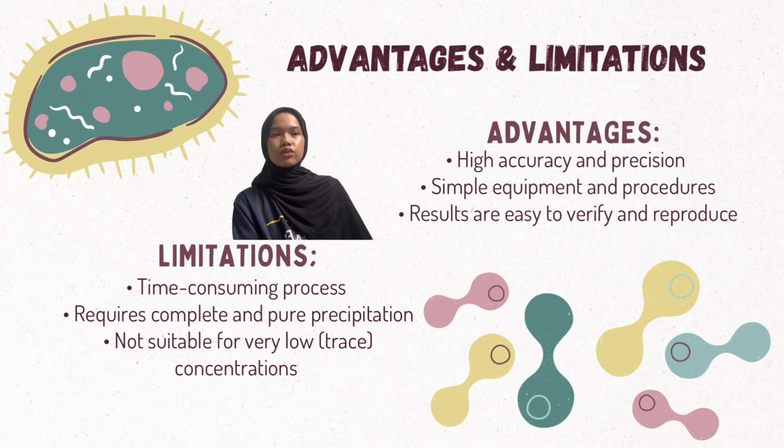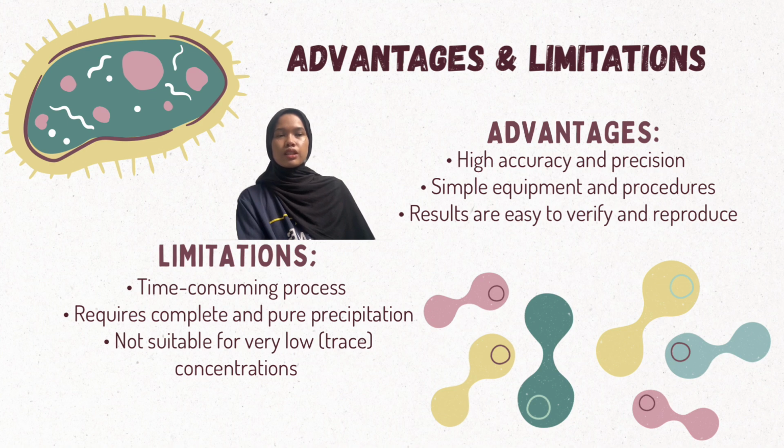Now, let's take a look at advantages and limitations. There are some advantages and limitations in gravimetric analysis. For the advantages, it is high accuracy and precision. It also requires simple equipment and procedures. And the results are easy to verify and reproduce.